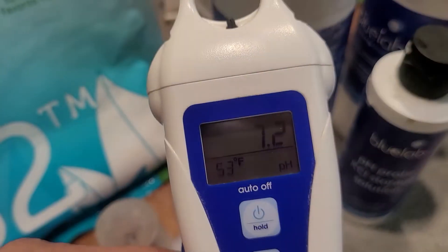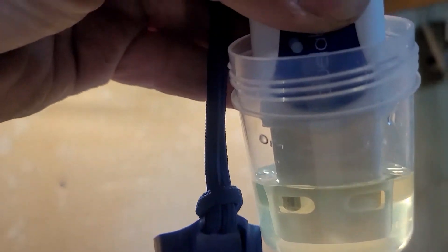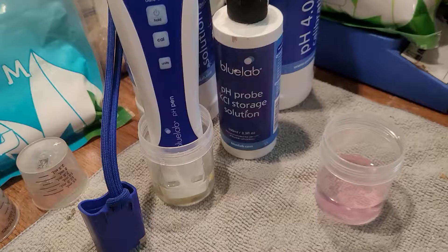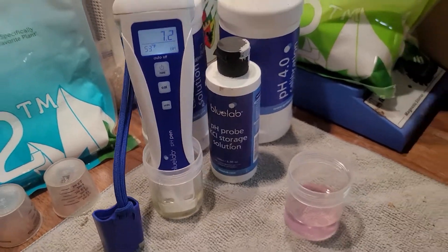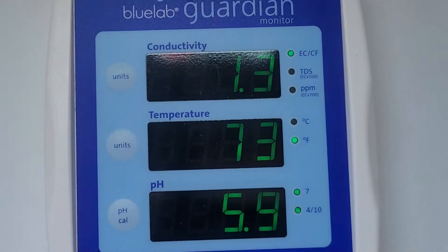Just make sure everything's covered up like that, then we're going to let it sit. Make sure it's not moving up and down or anything like that. We're going to leave it in there for a little bit and go check out the Guardian meter.